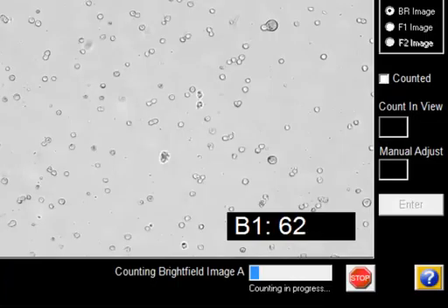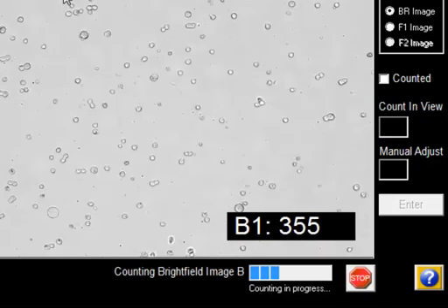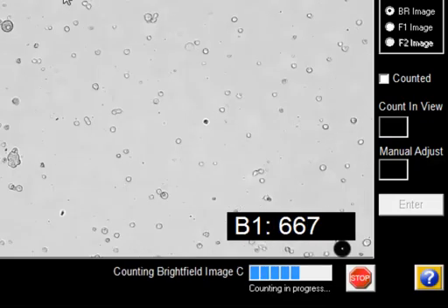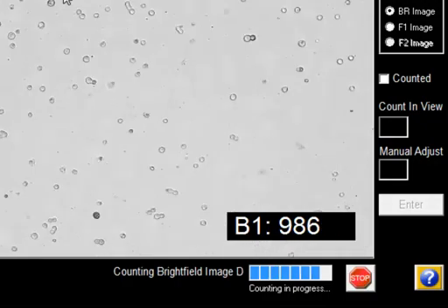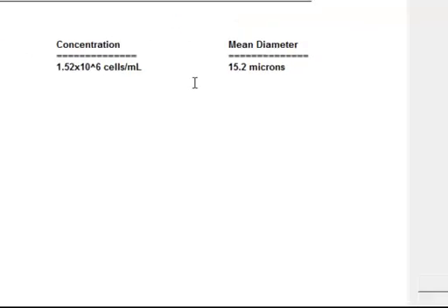In less than 60 seconds, bright field and fluorescent cell images are captured and analyzed based on preset parameters for GFP analysis.